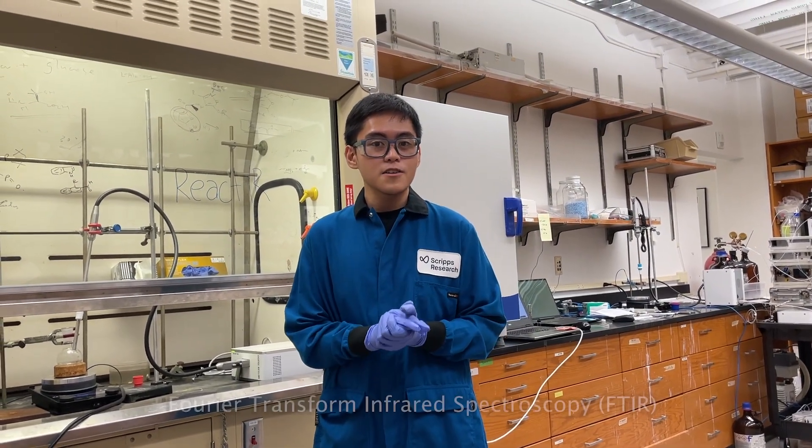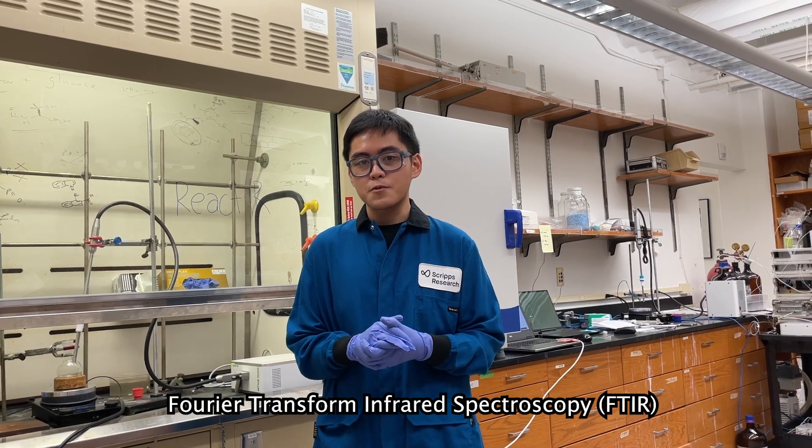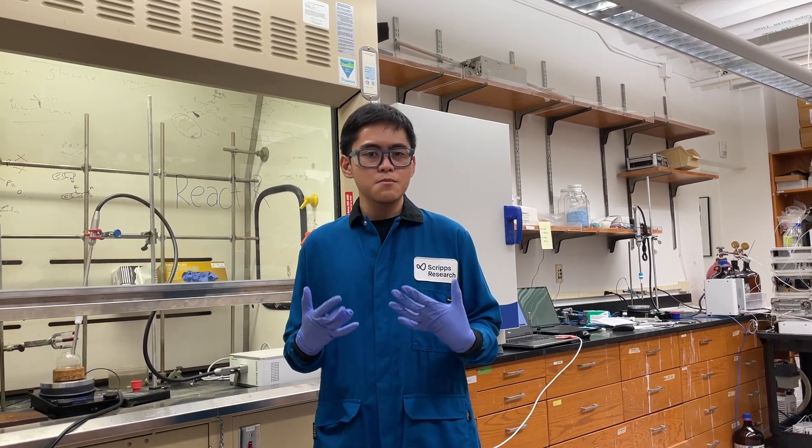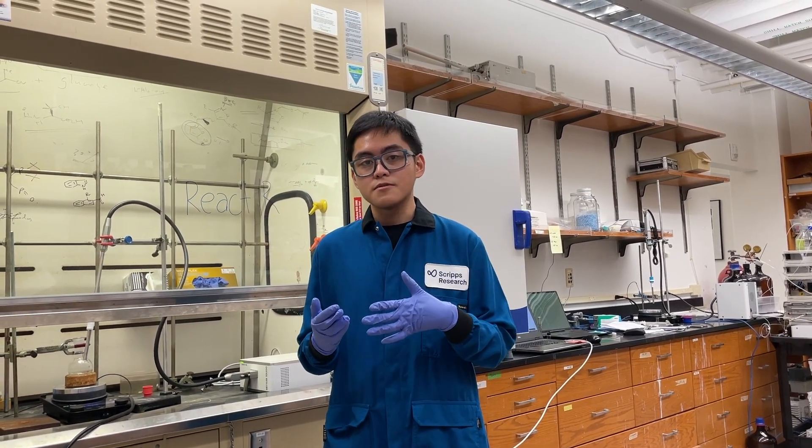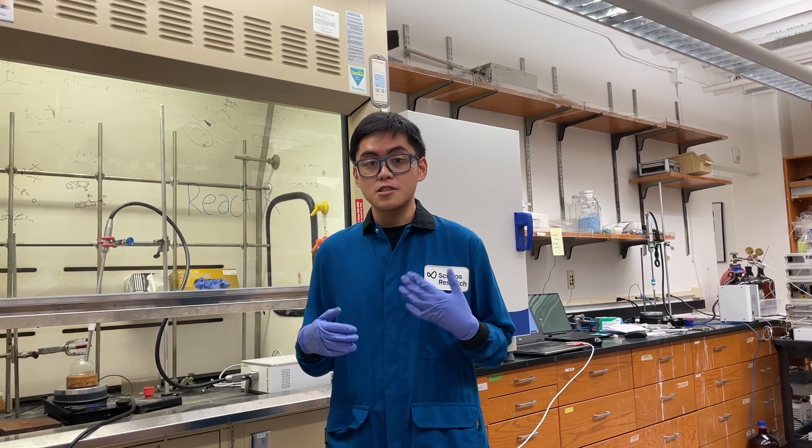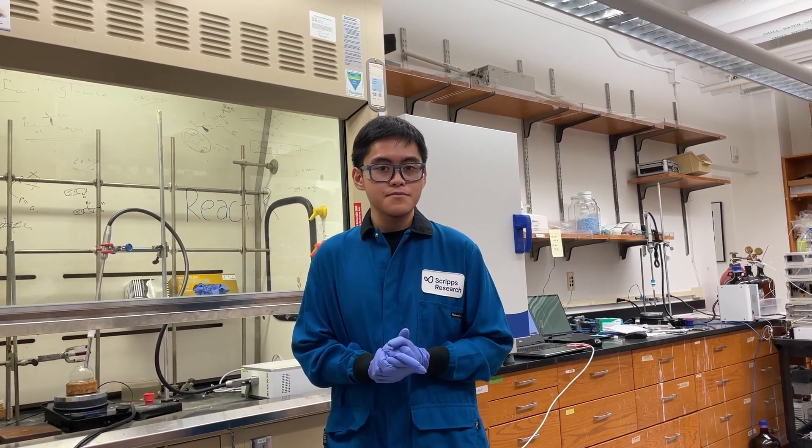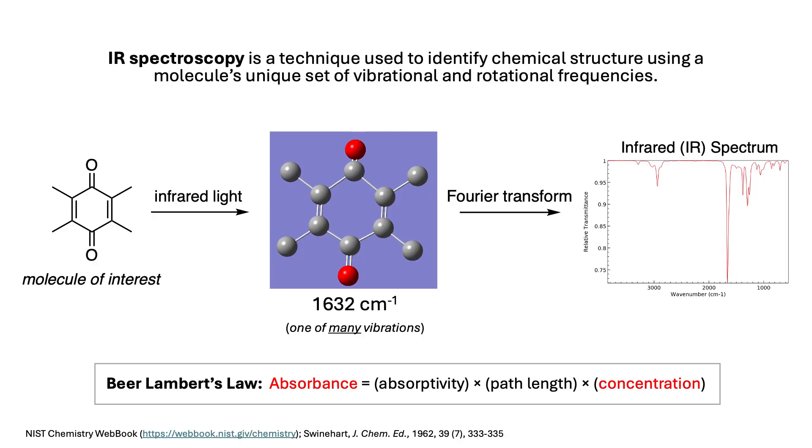Let's start with a quick refresher on how the FTIR or the Fourier Transform infrared spectroscopy works. FTIR works by passing infrared light through a sample and it also measures how much of this light is absorbed in the sample. Different molecular bonds absorb specific wavelengths of this light, creating a unique spectrum for each molecule.